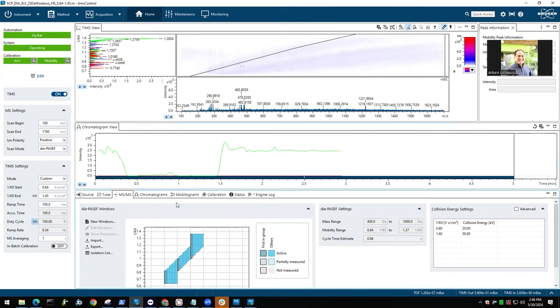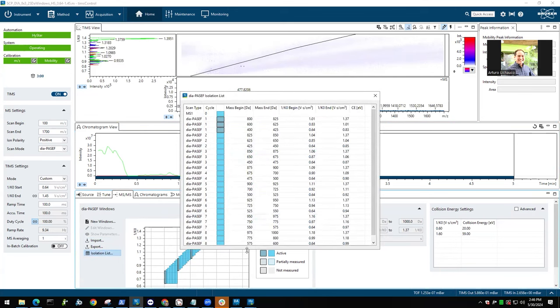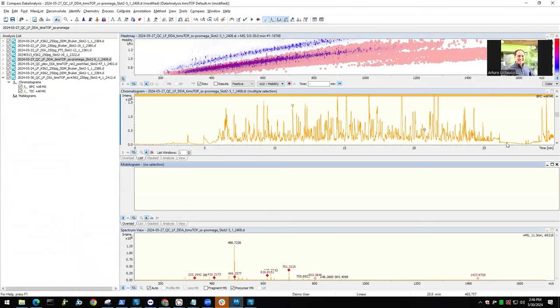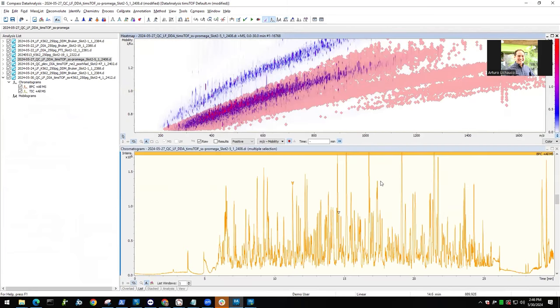And what we try to do is to cover a certain range. I might go to a different program first to show you that. So, let me get a few things out of the way. That would be a typical run where we have our base peak chromatogram down here, this range here. And this would be the same ion mobility view which we had in TIMS Control.